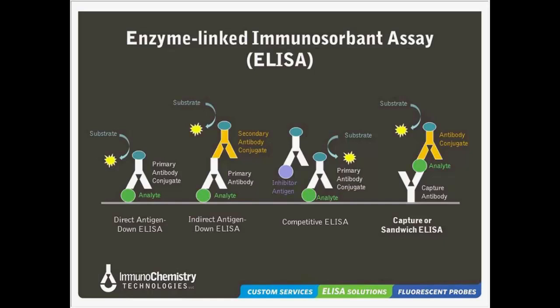And so what they will have to do is instead come in with their top antibody, and then say their top antibody is a mouse antibody and the plate captures a rabbit. Then they'll have to come in with a top antibody, mouse anti, whatever that analyte is, but it's not labeled, so you have to figure out how to get the signal out of it. And by doing so, you have to come back in then with a third antibody.